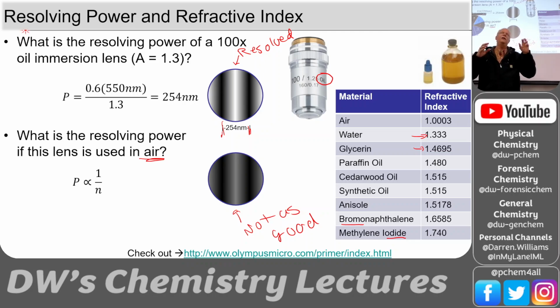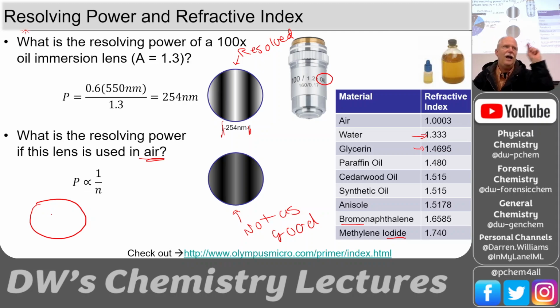It bends when it hits a material that has a different refractive index. So in a microscope, how is it that we see the edges of something? So let me draw two particular situations. We've got the field of view here. And let's say we want to take a picture of a glass fragment that was found at a crime scene. And so we've got a glass fragment that looks like this, okay?